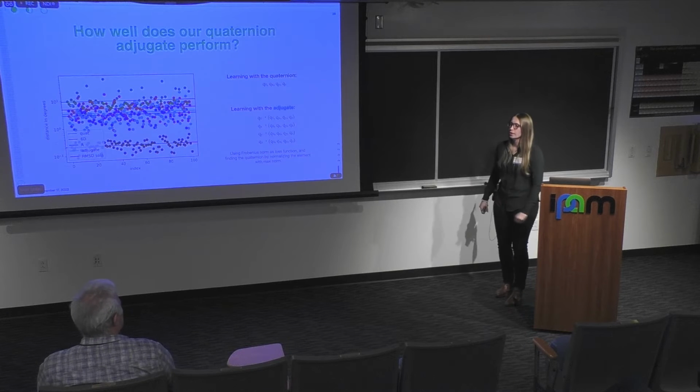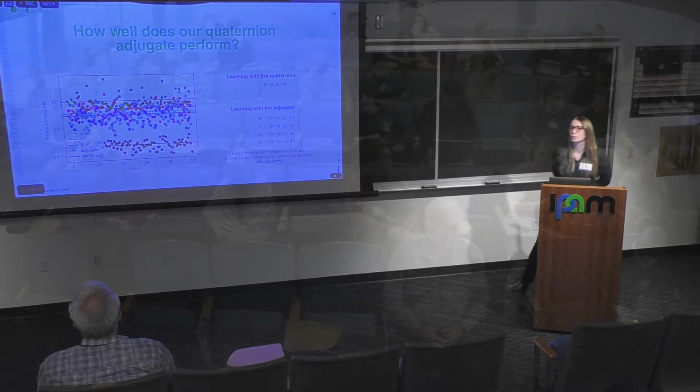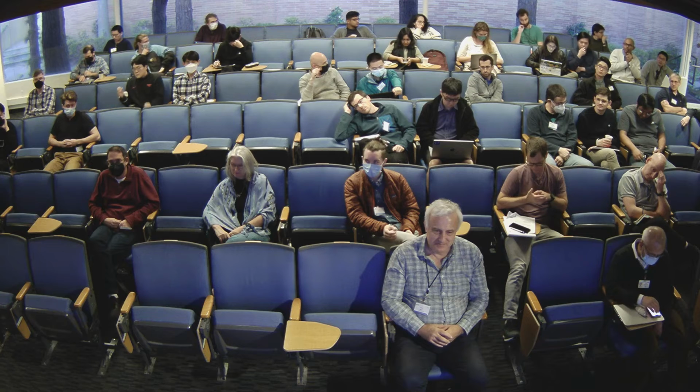Yeah. So how does Earth mover's distance kind of work in this context, like if I use that to align point clouds? So I think Earth mover's distance is when you don't have the matched points. In this case, we have matched points, and so RMSD is going to give you the solution. Yeah.